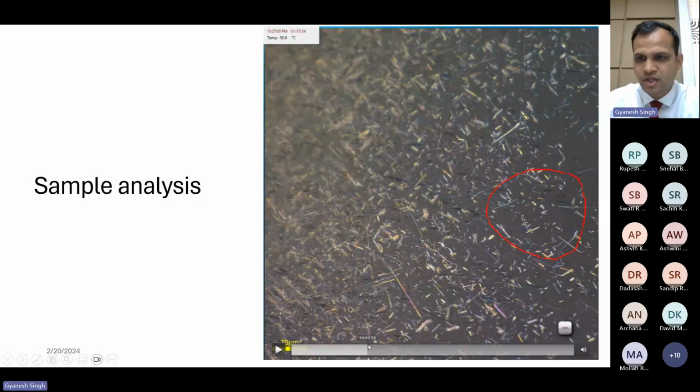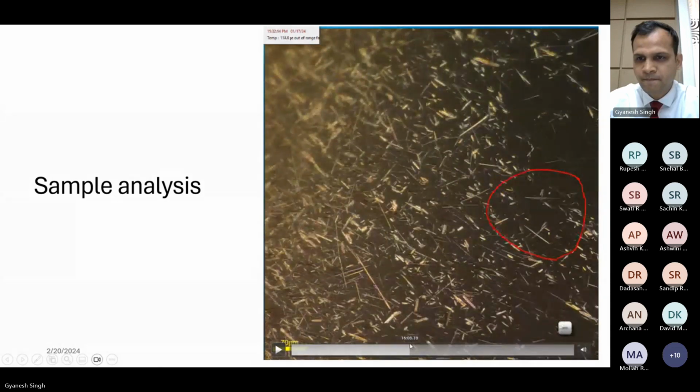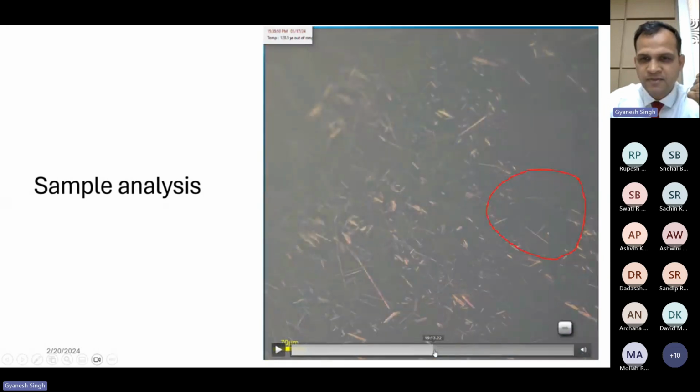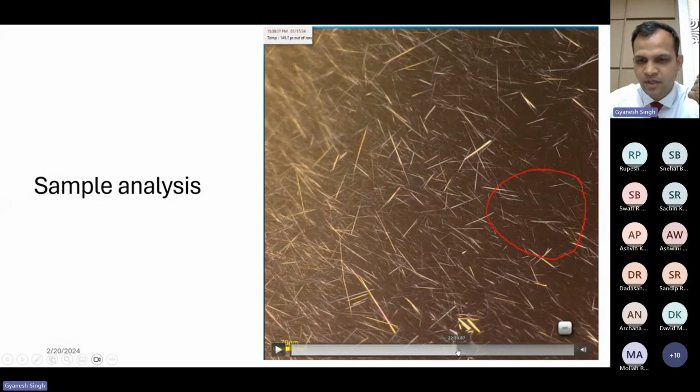So these are the excipients which are melting. In the first form, you can see that there was melting happening, but it was not easily seen. It almost took us 15 minutes to understand that change. Now you can see these bigger particles, they will also start melting at a specific phase. Like it has started. Can you see this one over here?